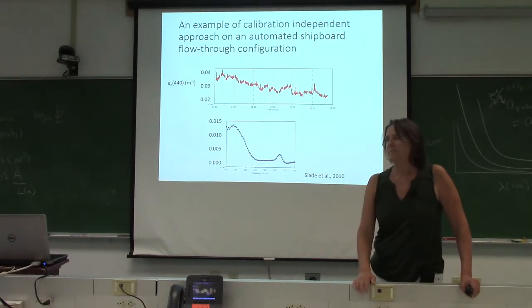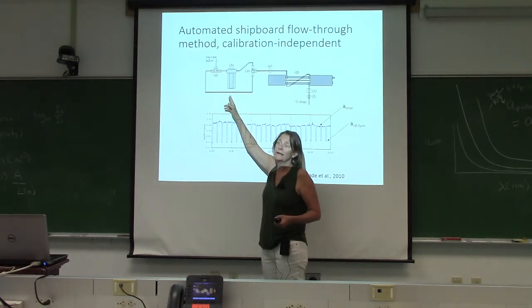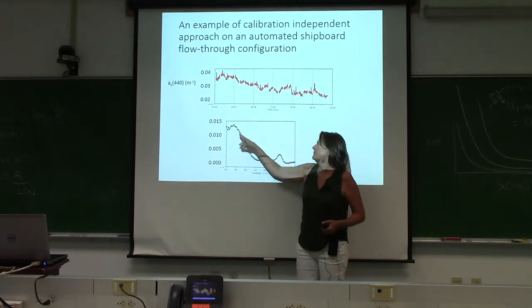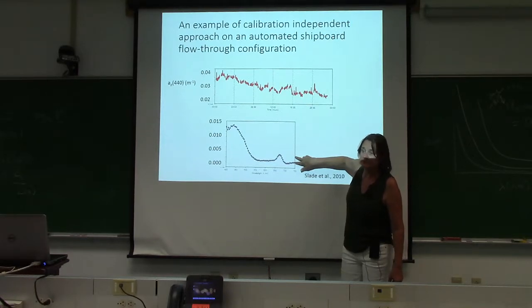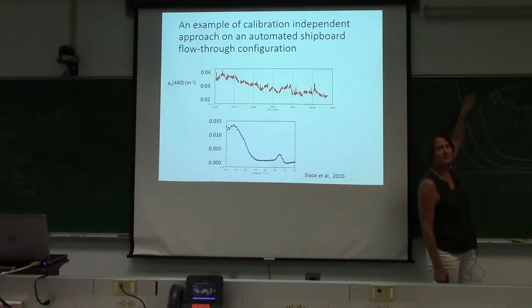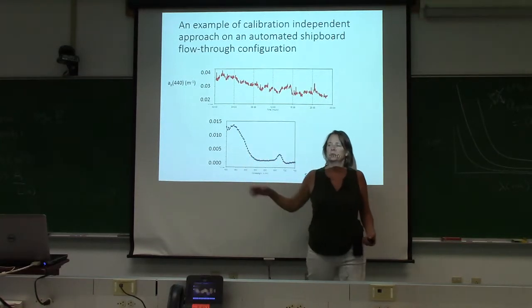Short answer, no. But you could imagine something in here that oxidizes the pigment, which isn't great because the absorption shows up somewhere. Or the other thing that people do is you model it. The great thing about non-algal particles is that it's an exponential. So if you know something about the absorption offset here, if you didn't scattering correct, it would give you some magnitude of that, and you could extrapolate it back with an exponential. There'd be a lot of uncertainty as you got to the blue, but it could be a first check if you know the slope. And then you could subtract that non-algal particle using modeling. I've done that before. It works. It's better than not doing it, but you just have to make sure you have your error bars.